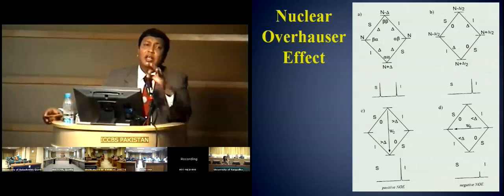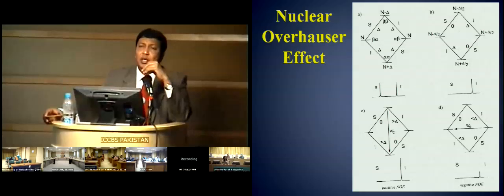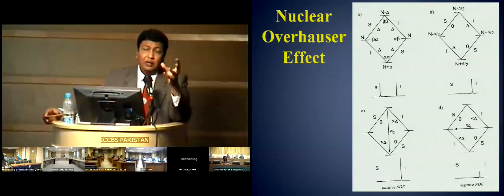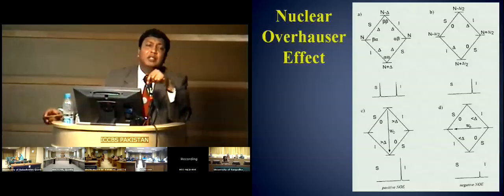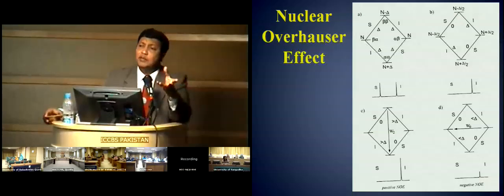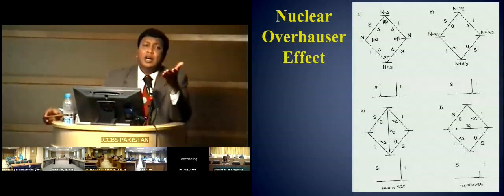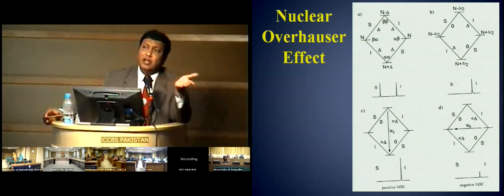Remember, modern inverse NMR spectroscopy doesn't really need a BIRD sequence. I want to tell you, because of a simple reason, that the proton to carbon transfer and the carbon to proton transfer would only take place when you would have a C13 in between. So the modern HMQC spectrum, which is called modern inverse NMR spectroscopy, doesn't really require BIRD.